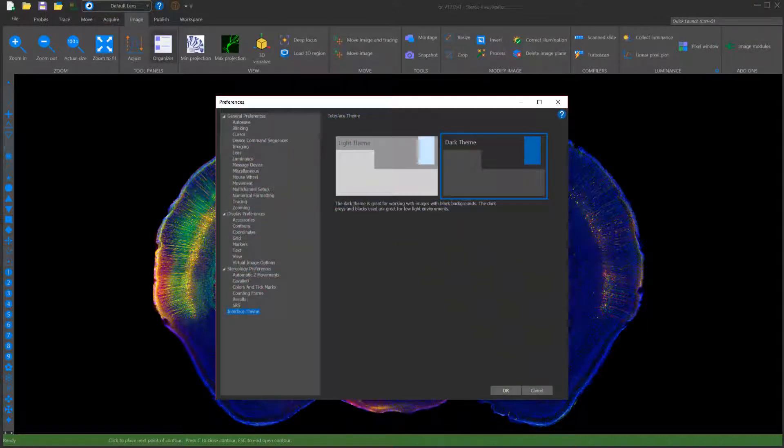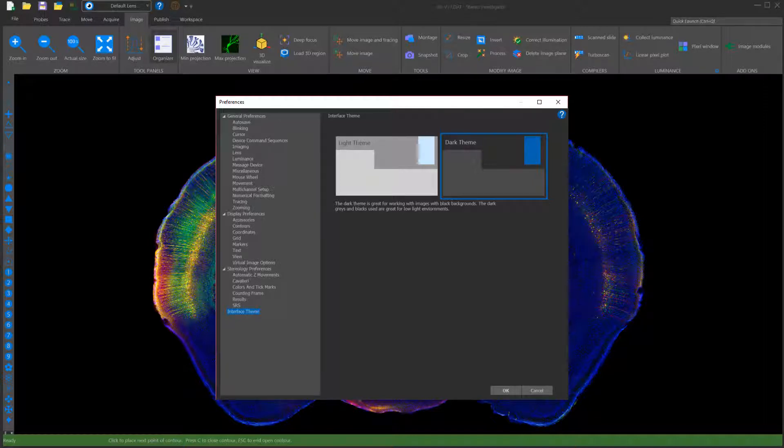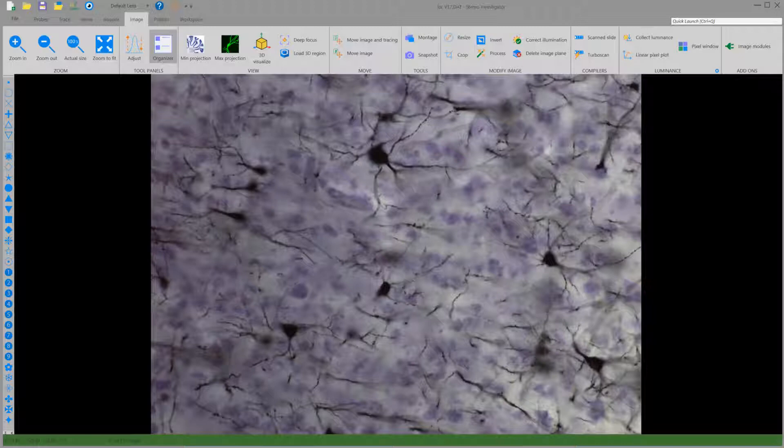I've been using the dark theme for this quick demonstration, which is great when working with fluorescent tissue. But there's also a lighter theme that is great for bright field tissue.